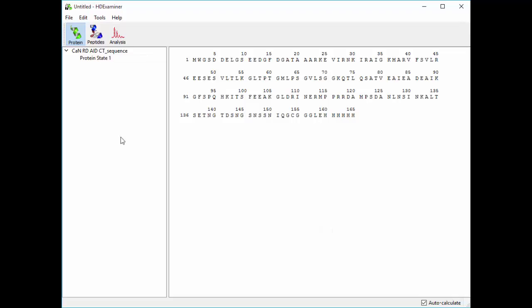So one of the great things you can do with an HDExchange experiment is to compare two or more states of your protein, such as stressed versus unstressed, mutant versus wild type, or in this case, ligand bound versus unbound.